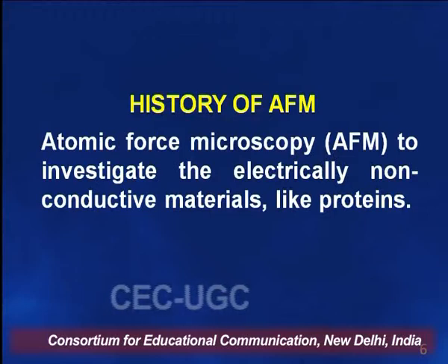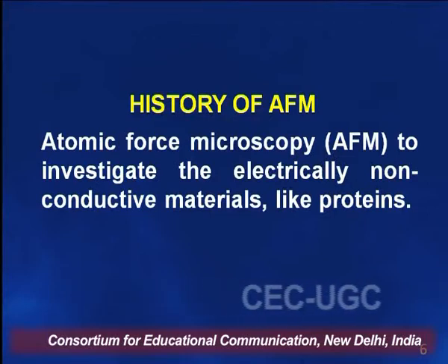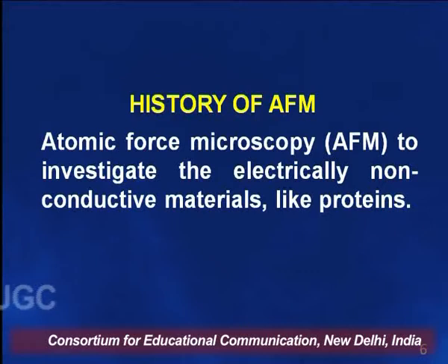Now what is the history of AFM? Basically atomic force microscopy is used to investigate electrically non-conducting materials like proteins. Means we can scan biomaterials also. So it is also used for non-conducting materials like proteins and other tissues.